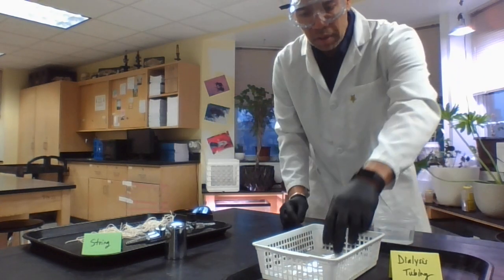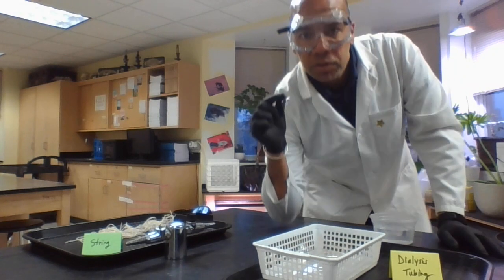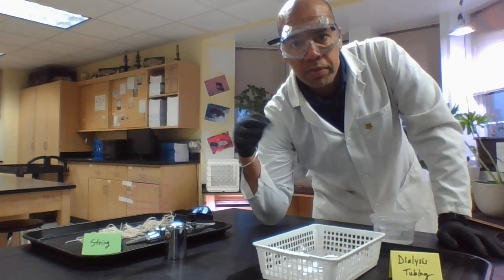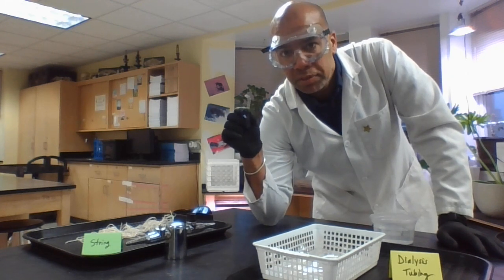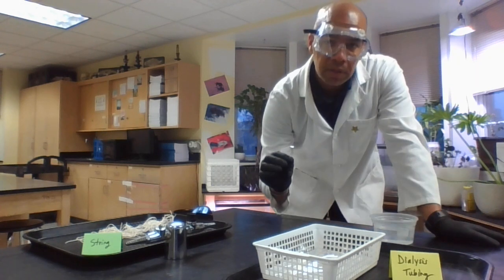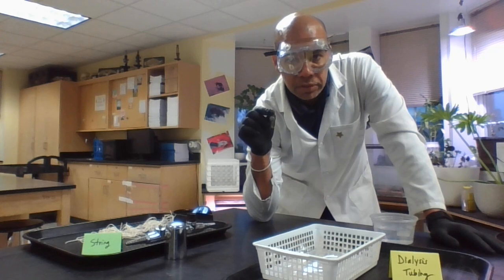Okay, so here is one dialysis tubing. Now, dialysis tubing is used for patients who have issues with their kidneys not being able to filter out their blood. And this tubing is inside a machine that their blood will go through. It traps the gunk, the bad stuff, the waste that your kidneys would normally trap, and then the clean blood can continue to go through and come back to your body.